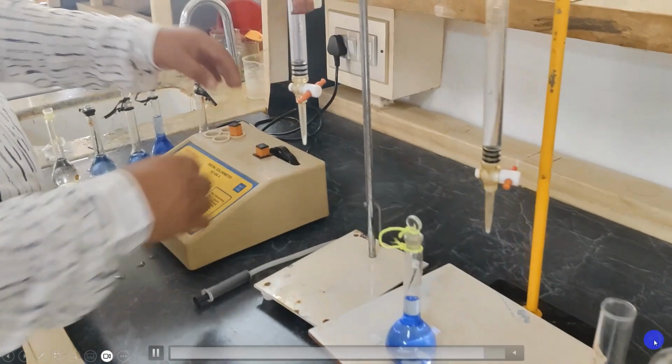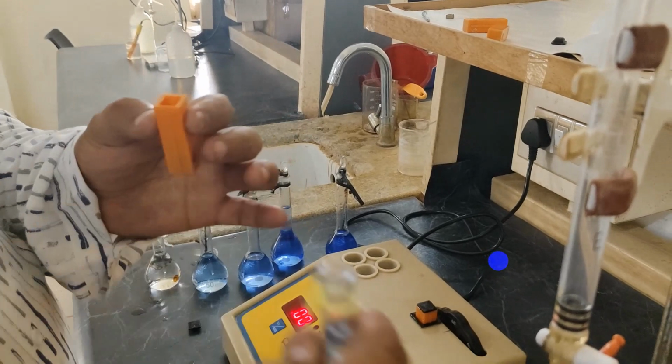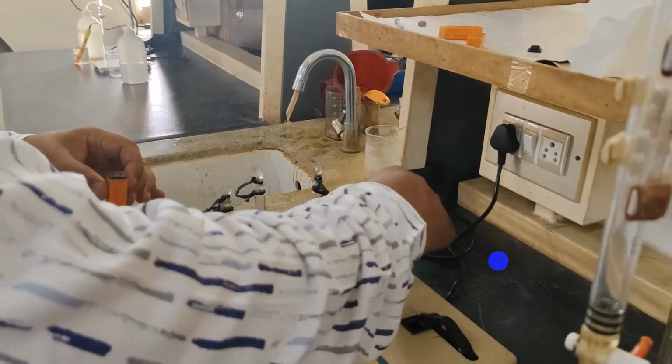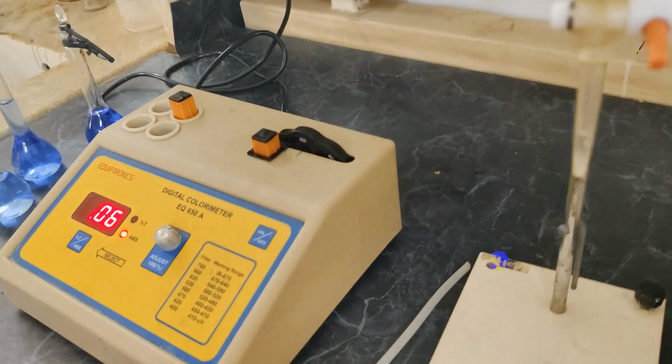So record the absorbance now. Record the absorbance provided by the test solution. Note down the reading.